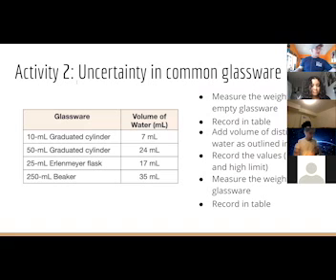And this is why I would suggest using the transfer pipette, because like I said, trying to pour 7 mils of water in here is going to be really hard. So what I do is I just take my glass of distilled water, draw it up with the transfer pipette and then put it in here. It also keeps me from getting water on the sides.